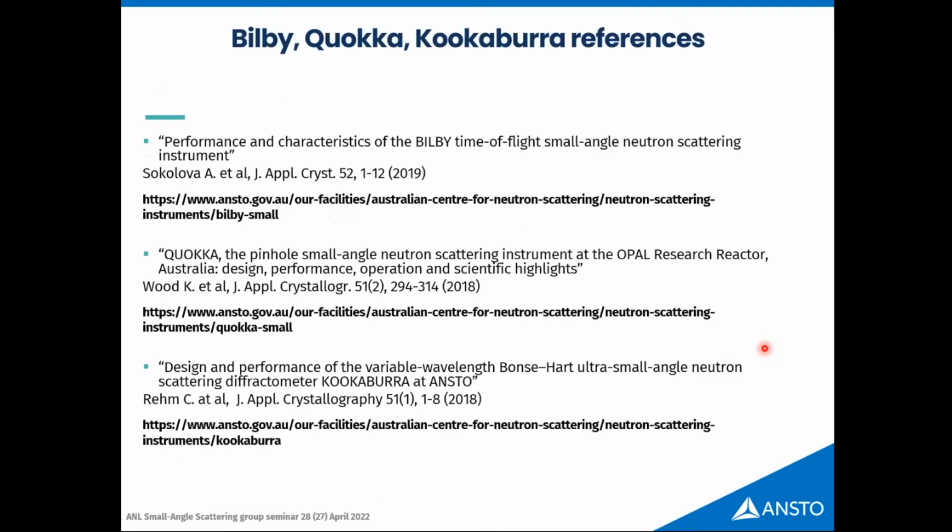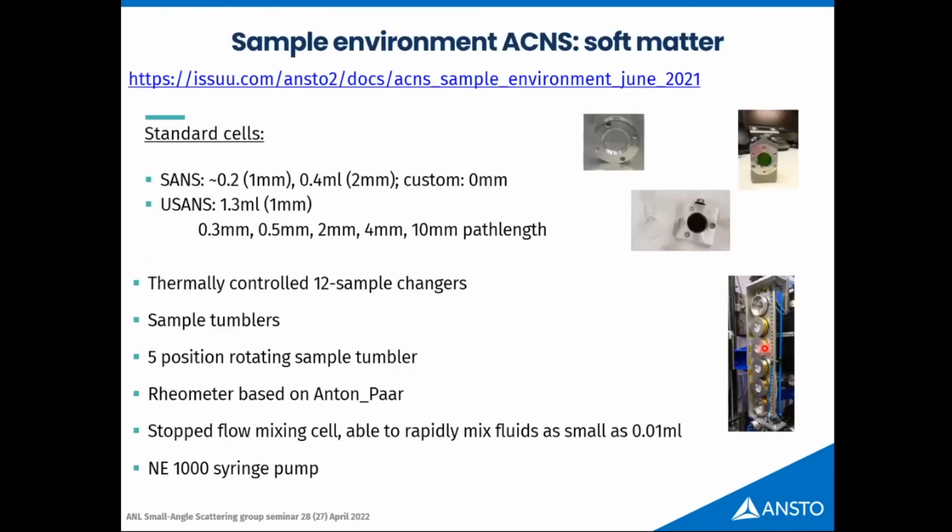Again, I leave this slide just to look up later, but this is what I want to say about the instruments. And now I just wanted to show you very briefly what kind of science we can do, maybe to impress you, just nice pictures. So now we know we have instruments, but that's entertainment for us; the main point is what we want to do for users. For users, we have, as I think any facility would say, a set of sample environments which users can demand. We also have a chance to help users develop their own sample environment.